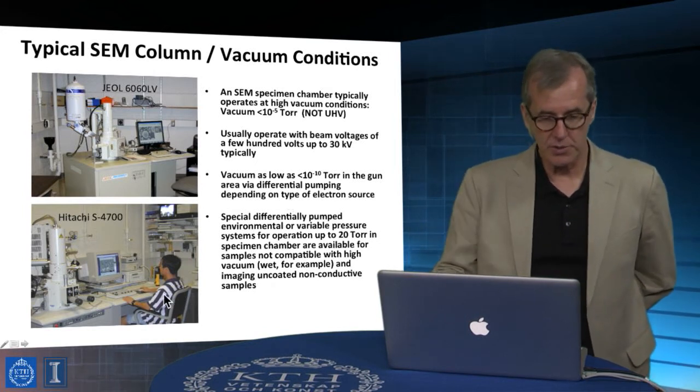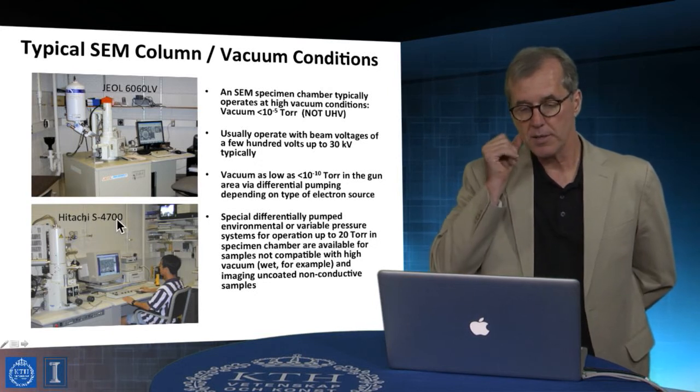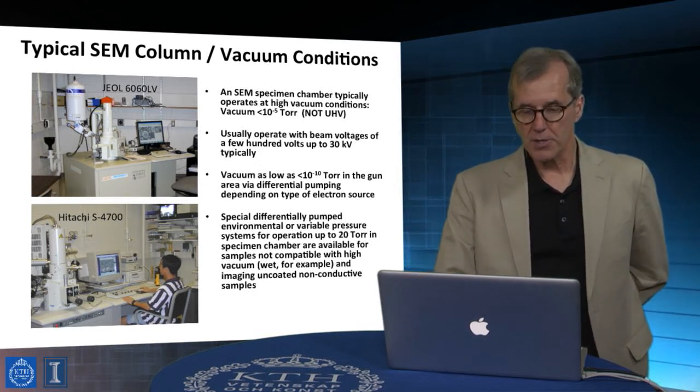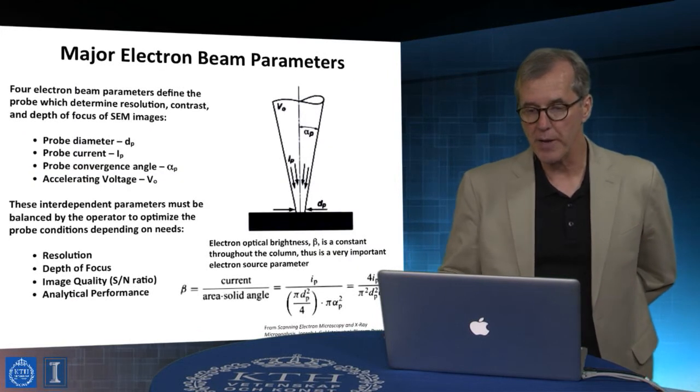And here's a real student sitting in front of an SEM actually working it. This is a fairly capable one. That's a Hitachi instrument that's actually a very high quality analytical microscope.